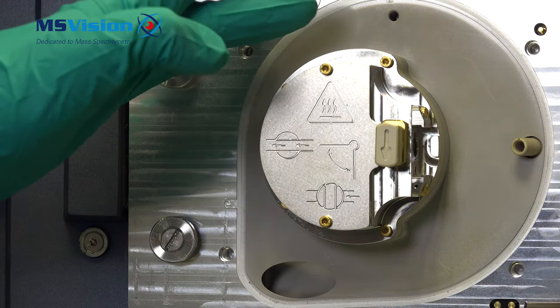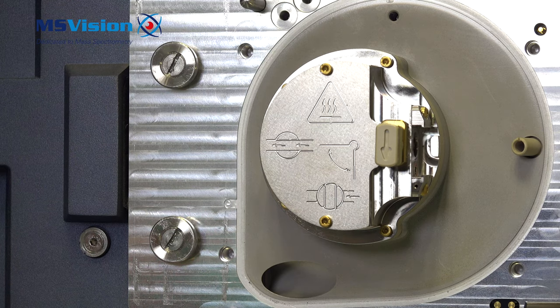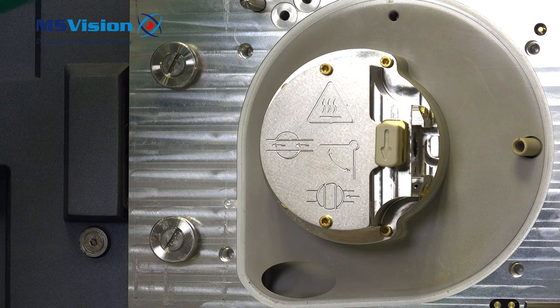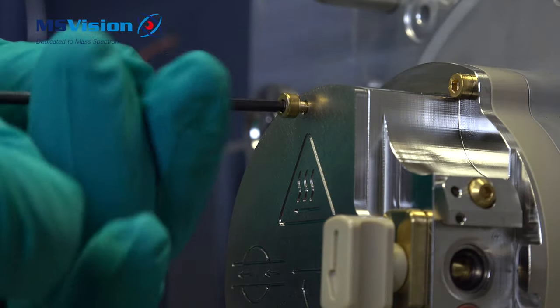Ensure that the source block has cooled down as it can be very hot before we can remove the source. For safety please take out the mains power lead. We can now open to show the heater and remove the source block.